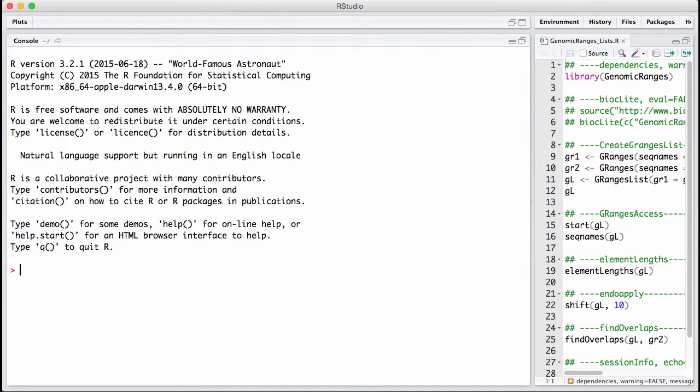This is basically similar to a normal list in R, but a GRangesList you can think of as a list where each element is a GRanges. Behind the scene in these list-like objects and GRanges, there's some optimization going on that makes them very efficient to compute on.